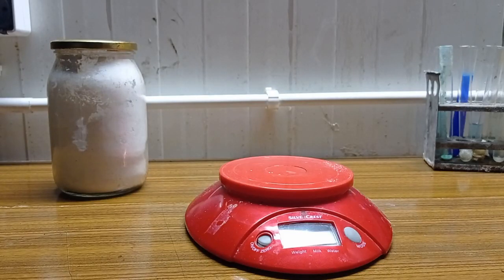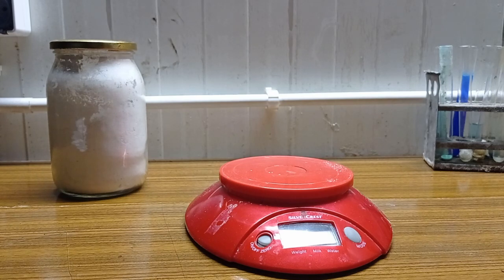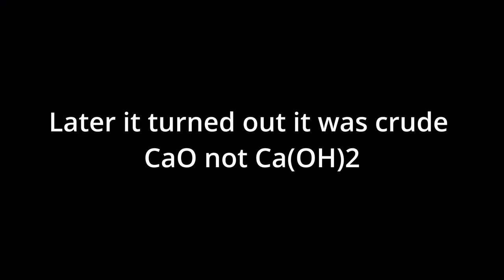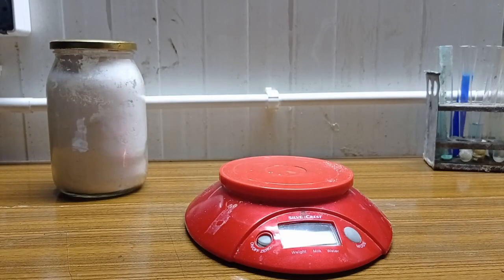Hi guys! Today I'm gonna convert this crude calcium hydroxide with some calcium carbonate to calcium oxide. I'm gonna make it with a furnace because calcium carbonate needs very high temperature and I can't reach it with just a heating plate.